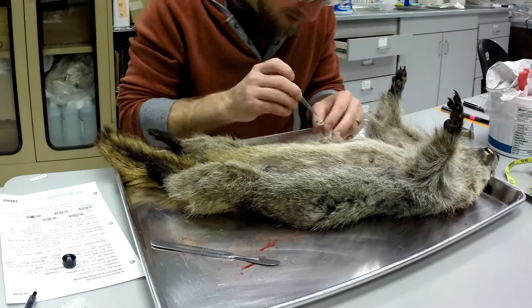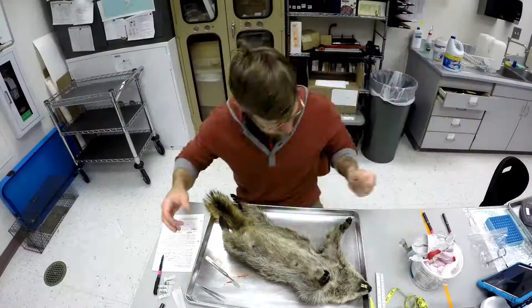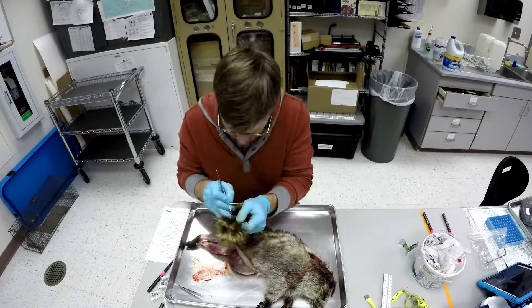We take standard body measurements like length and weight. If fleas and lice are present we will save those, and then the skin is removed. The skin will be later stuffed with cotton and dried.